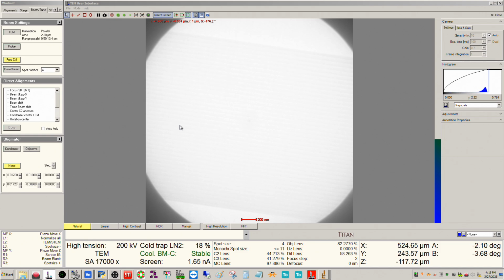So, have a little bit of appreciation the next time this is happening. I know it's a little bit of a pain to have to wait. Nobody likes to wait. As my father famously said, wait is a dirty four-letter word. But understand it's for your benefit, right? And for the benefit of the microscope to run normalization to help reproduce the lens settings.